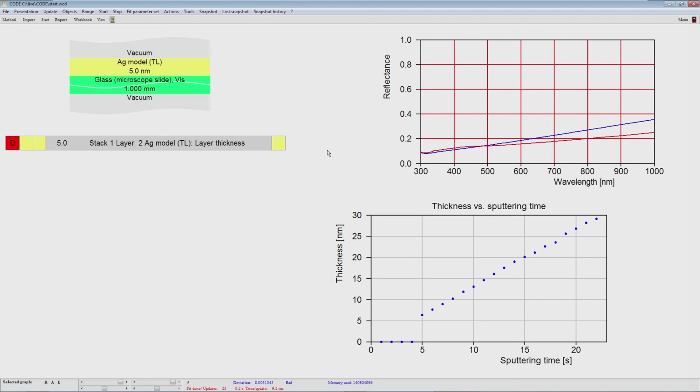Okay, let's generate another graph, which is the graph of the fit deviation, so that we can see which are the fits which work nicely. They will have a low fit deviation, and which are the fits that generate a problem. So let's do this once more.